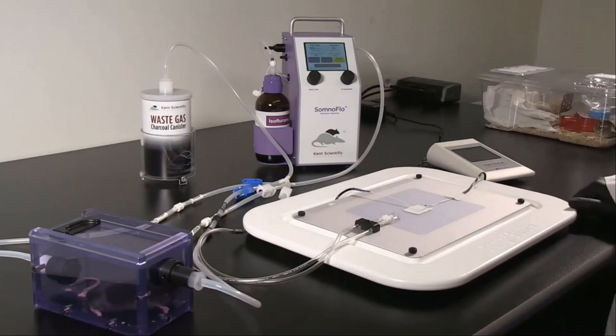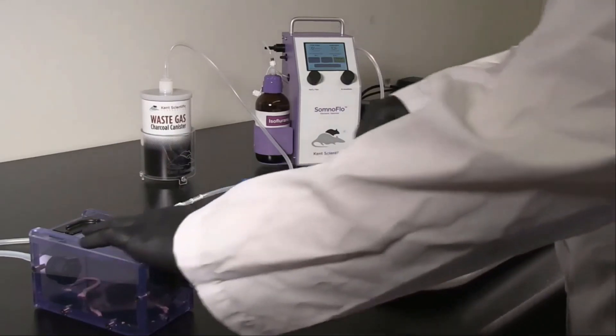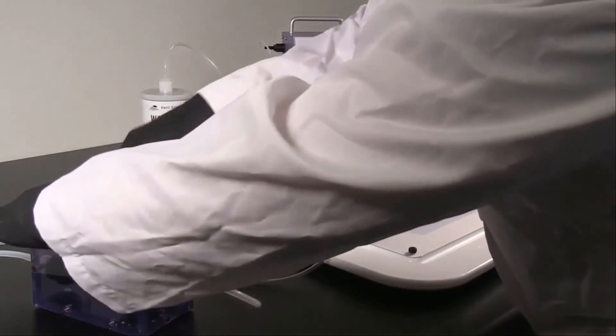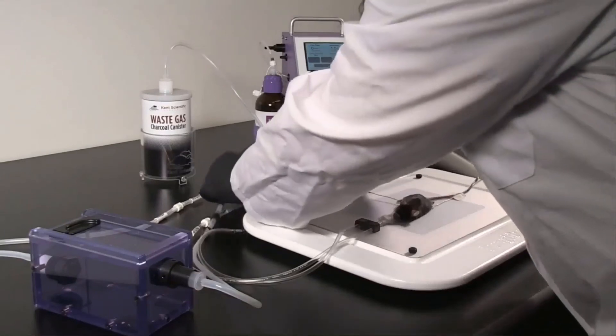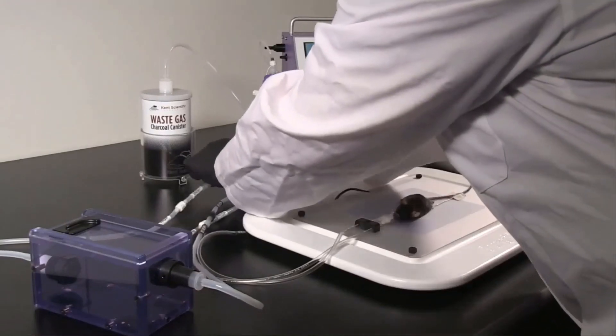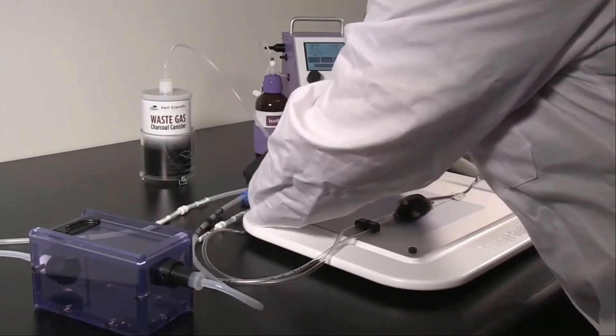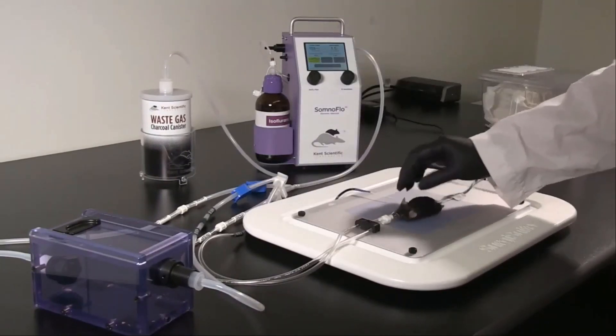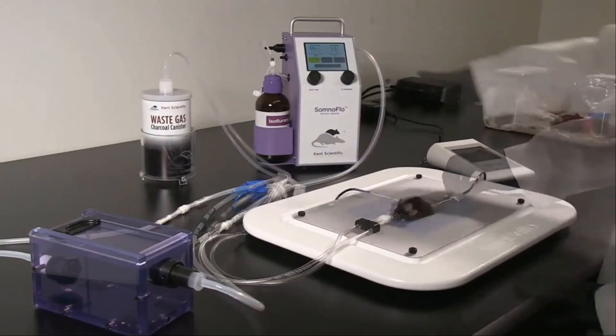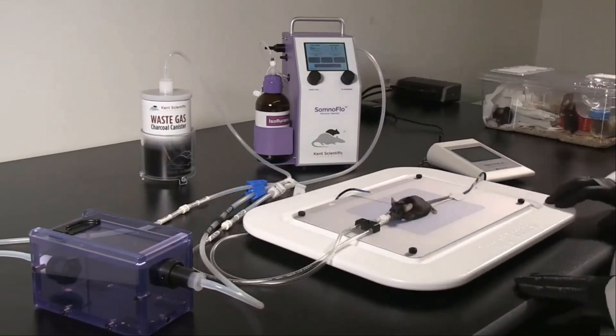If desired, purge the chamber using the Purge feature. Remove the animal from the chamber and position on the nose cone. Be sure to adjust the clips to direct the airflow to the nose cone. Touch Low Flow to resume anesthetic delivery. When you're finished with the procedure, touch Low Flow again to stop delivery and recover the animal.